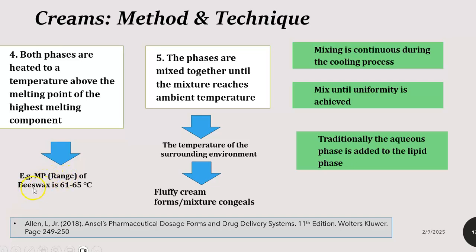For example, if the formulation has beeswax, which is a solid, waxy substance, if you look in the Martindale Pharmacopoeia, you'd see a melting range, and the book says melting point, but it's a range of 61 to 65 degrees. And so this cream would need to be formed at roughly 65 degrees, where you heat the water phase to 65 degrees, so that the oil phase would be 61 to 65 degrees. When you merge the two, they blend nicely together. So you need a thermometer whenever you're making your creams using the fusion method.